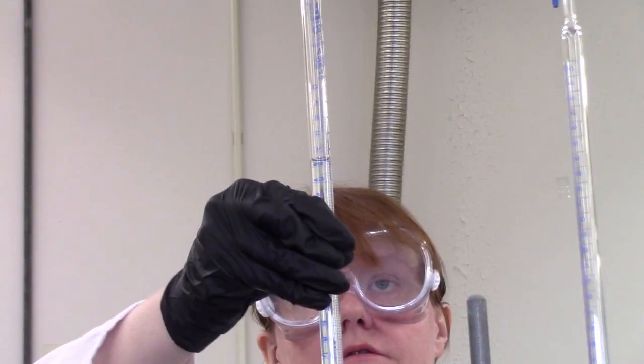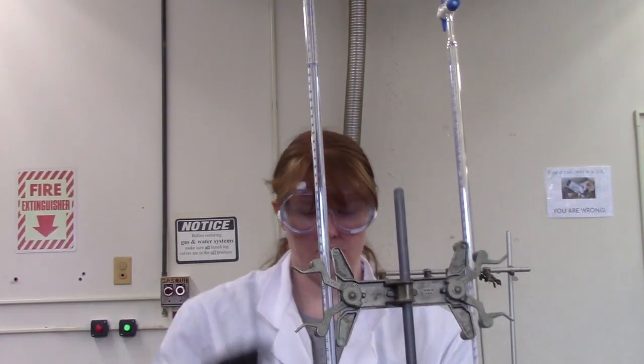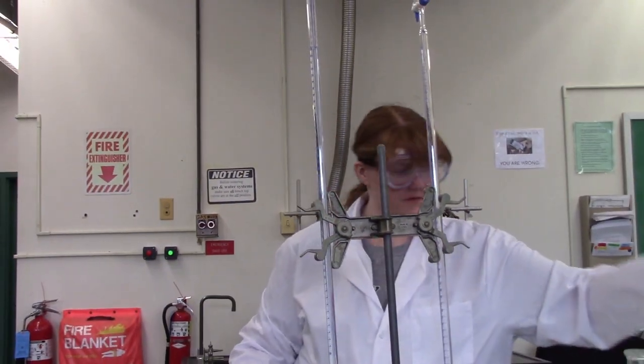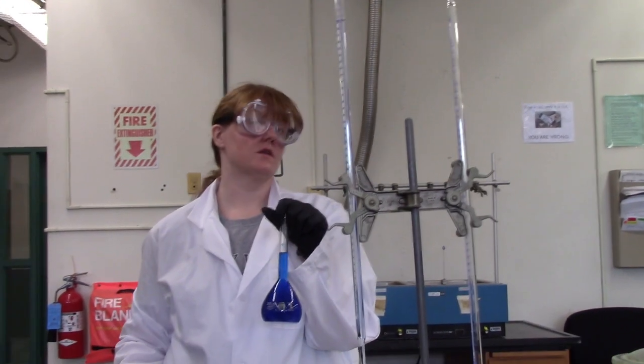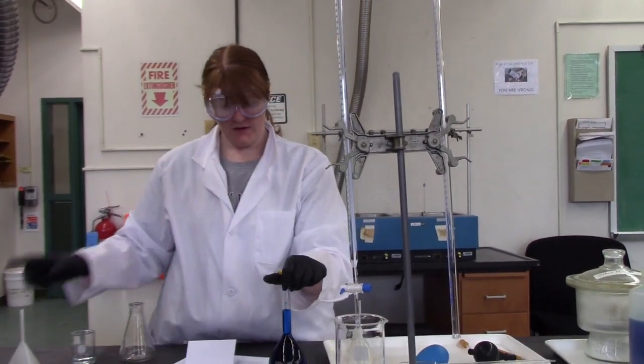Good? Okay. So that's how a buret works. So you're going to write down your initial volume, and then you're going to get your acid sample ready. In this case, we'll have our volumetric flask with our oxalic acid. Again, yours is not blue. I just use this as an example so you can see it better.